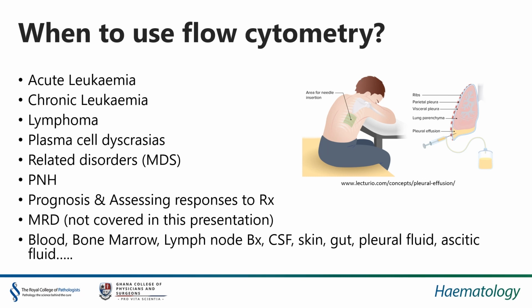Although this is not covered in this presentation, MRD assessment by flow cytometry is increasingly being used in clinical trials as well as endpoint assessments. Immunophenotyping is routinely carried out using blood, bone marrow, lymph node biopsies, CSF, pleural fluid, ascitic fluid, as well as skin and gut.